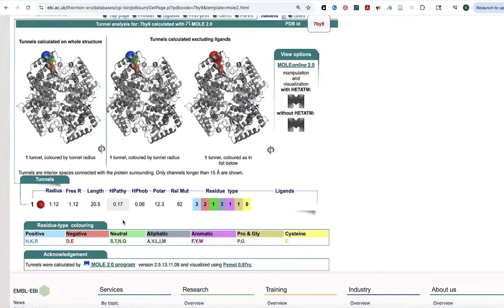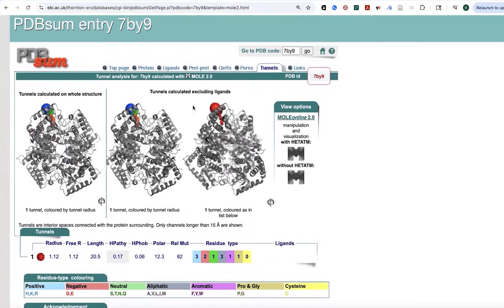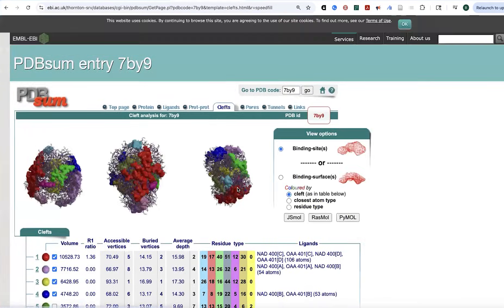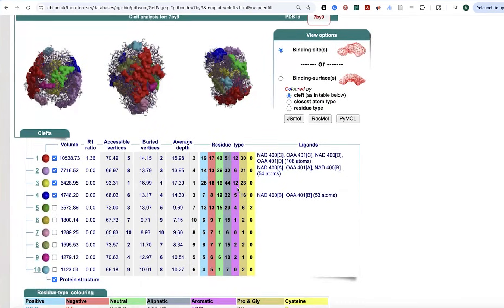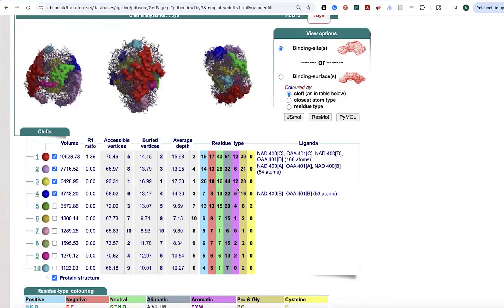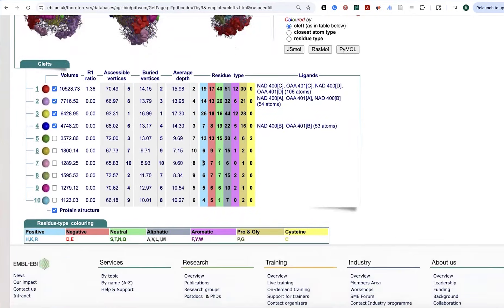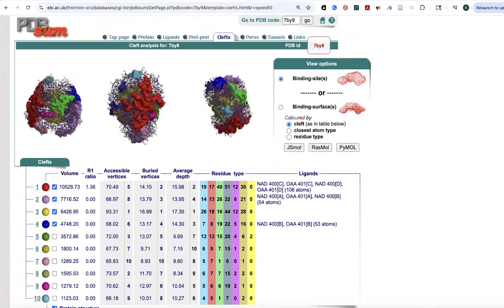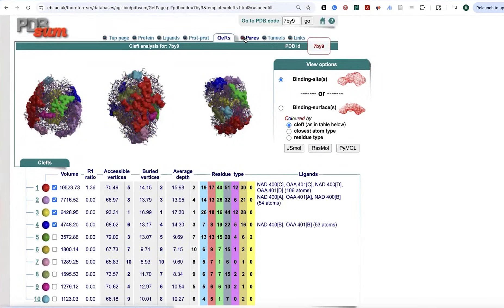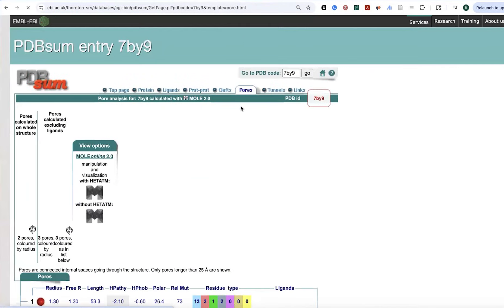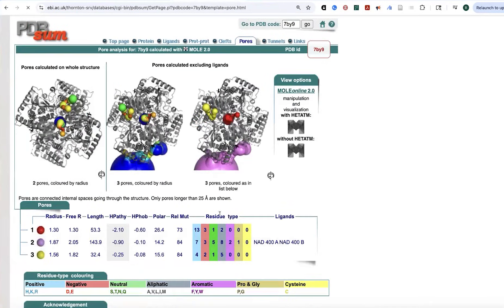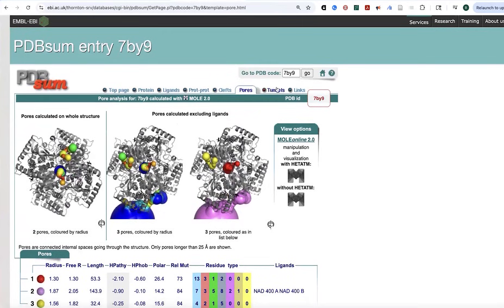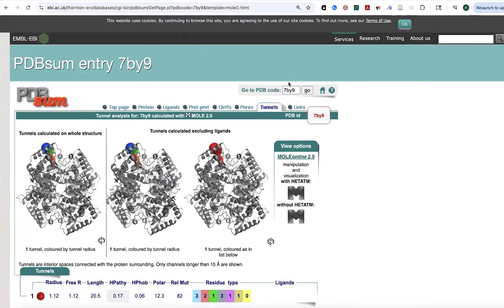You might be wondering, well, what are the characteristics of these clefts? Is it something that maybe something would bind to? And so you can see the different types of residues in these different clefts, the biophysical properties. They're colored by the biophysical properties. And then you can see where things might bind, what types of surfaces you have, various things like this.